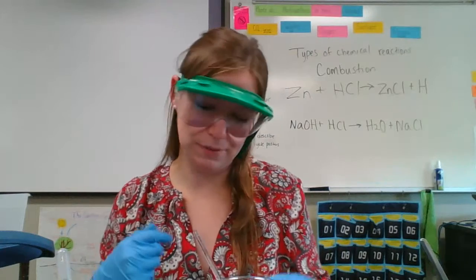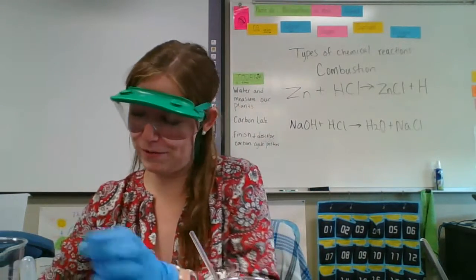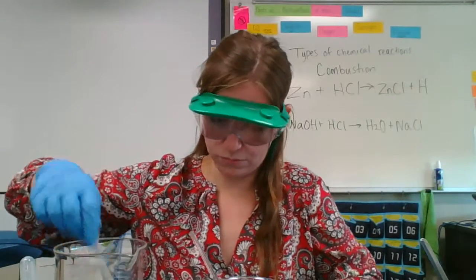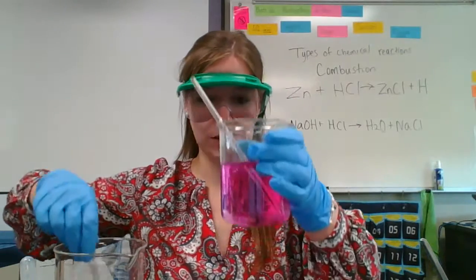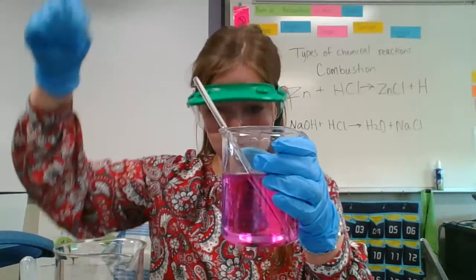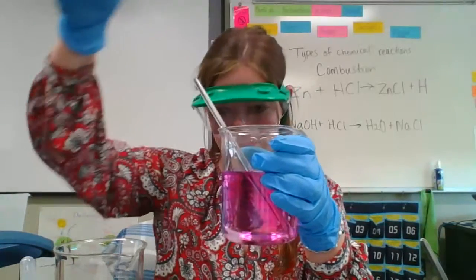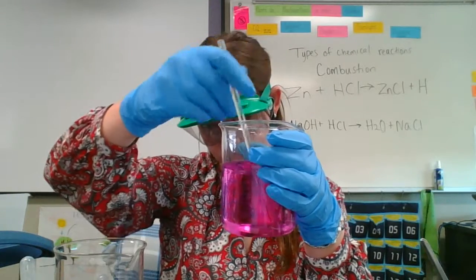And now I'm going to add some hydrochloric acid, which again, I'm going to have to use quite a bit of, it seems, unfortunately. And we are going to keep mixing this until we get another color change. Nope, not quite yet.